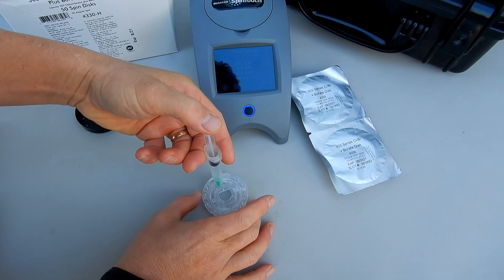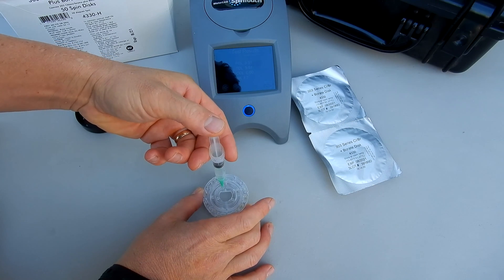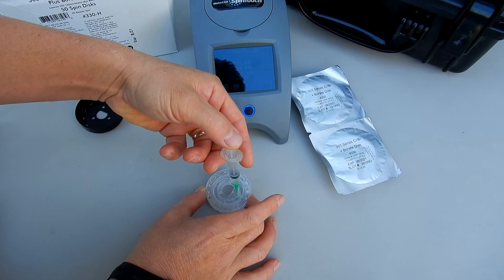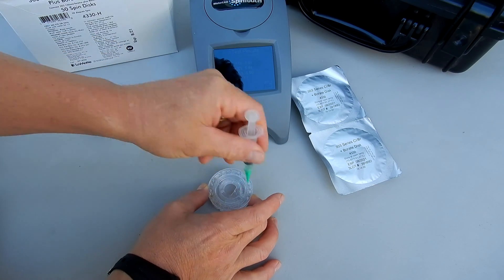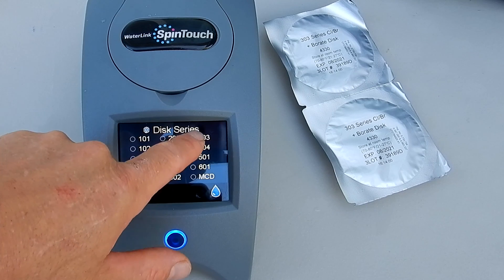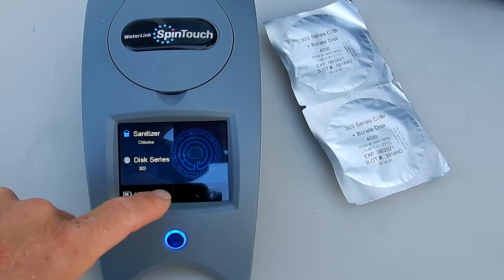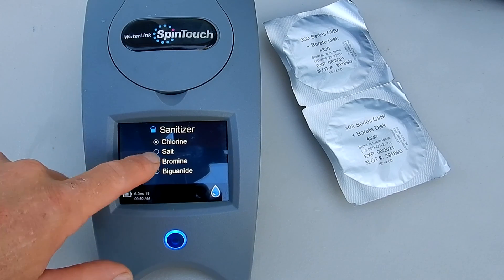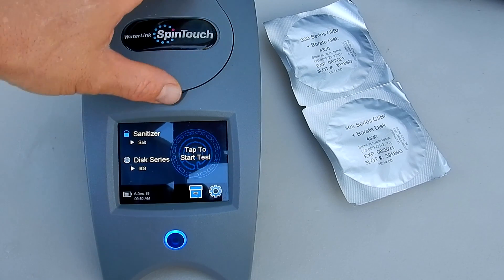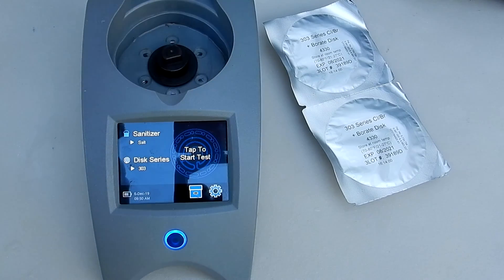This particular pool uses borates, so it'll give me a reading of the borate level in this pool. I want to change the disc series to the 303 — this is a salt water pool. I'm going to go ahead and insert the disc and run the test.